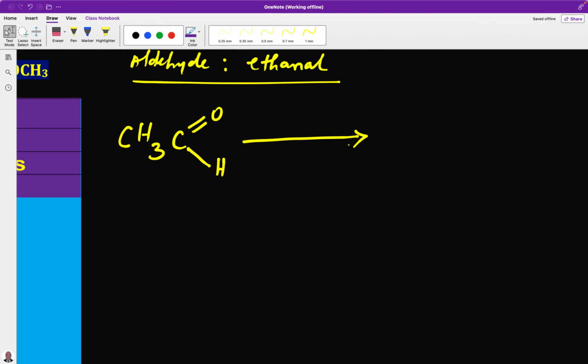In this case, we will have iodine plus alkaline aqueous iodine. There is halogenation. In this halogenation, the hydrogen atoms are replaced by the halogen, which is the iodine. We will have this. This is the product that comes here.